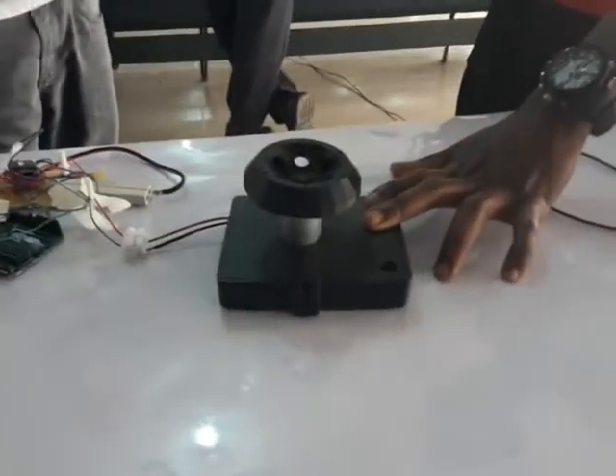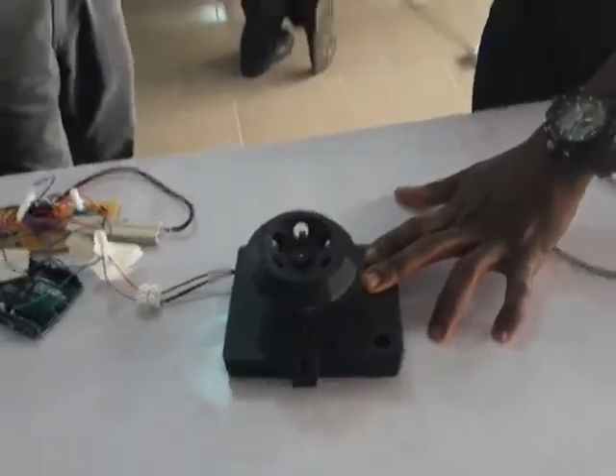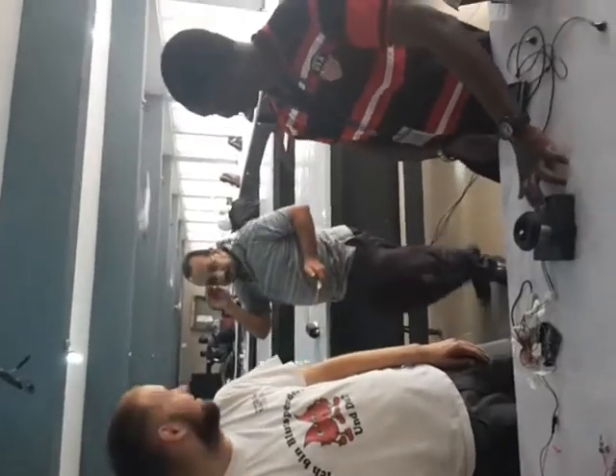This is the centrifuge that Sam and his colleagues from Rwanda built. Say hi. This is Ben, who helped them out, and E-Hub in the back — say hi, E-Hub.